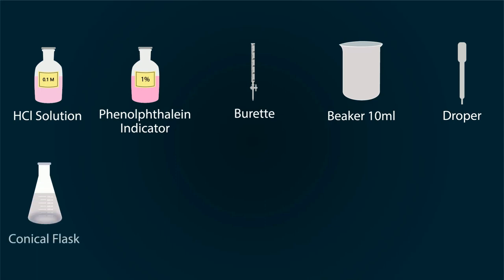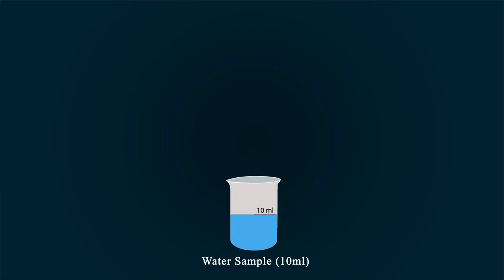First of all, take 10 milliliter water in a beaker. You can take water sample from your tap or from your laboratory. Now start adding 1% phenolphthalein solution into the water sample. You can add phenolphthalein with the help of a dropper.